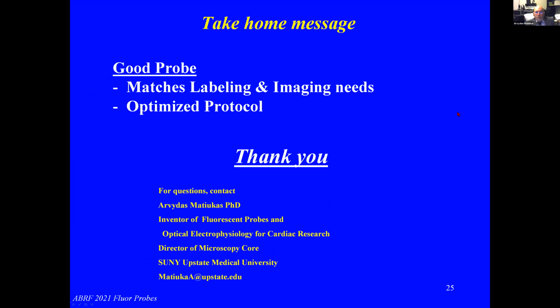So in summary, the take-home message is, what is a good probe? A good probe is the one that matches your labeling and imaging needs, and which is applied and imaged under optimized protocol. So thank you, and I am looking forward to questions in the chat, or here is my email. You can contact me later and privately.